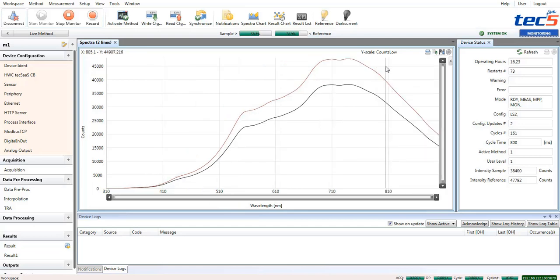For example, defined results may be shown as well.